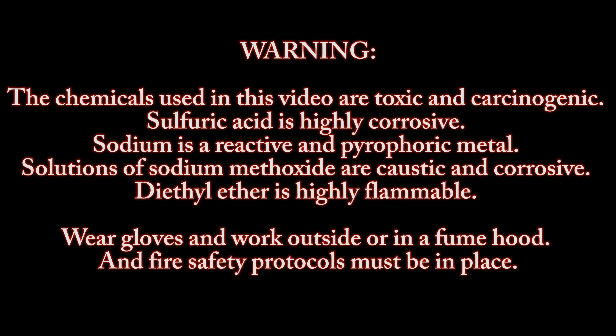Warning. The chemicals used in this video are toxic and carcinogenic. Sulfuric acid is highly corrosive. Sodium is a reactive pyrophoric metal. Solutions of sodium methoxide are caustic and corrosive. Diethyl ether is highly flammable. Wear gloves and work outside or in a fume hood, and fire safety protocols must be in place.